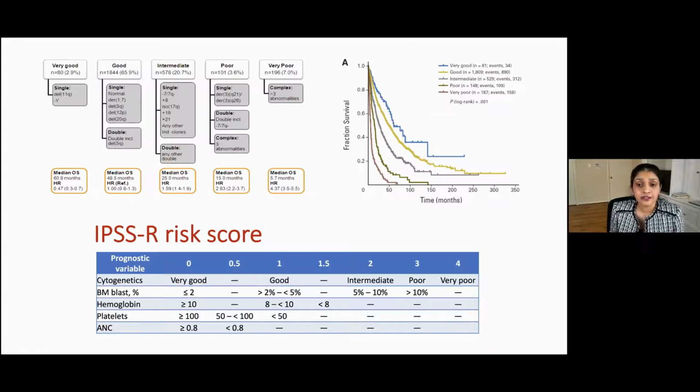Structural variants are very important in MDS for risk stratification. Despite identification of several gene mutations and molecular aberrations, the outcome of MDS is primarily dictated by the presence of larger chromosomal aberrations that are picked up by one of these techniques.